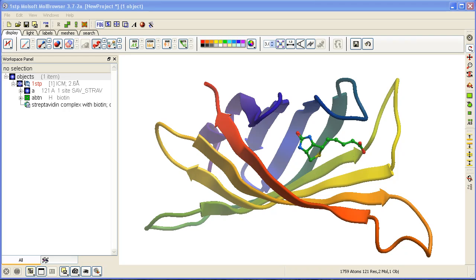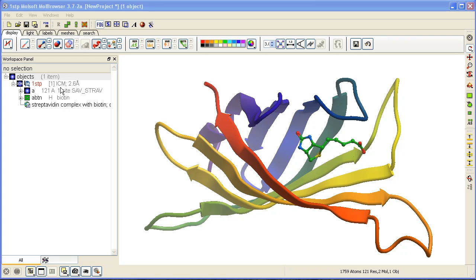How to display hydrogen bonds. In this example, we've loaded the PDB structure 1stp, which is streptavidin and biotin complex. To display hydrogen bonds, we first need to convert it into an ICM object from the raw PDB file.